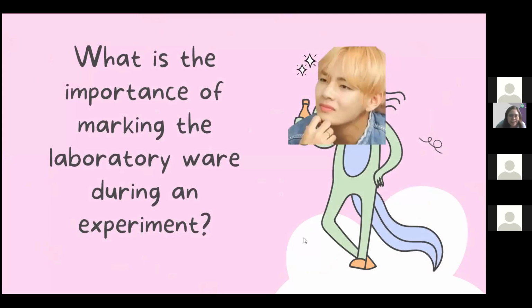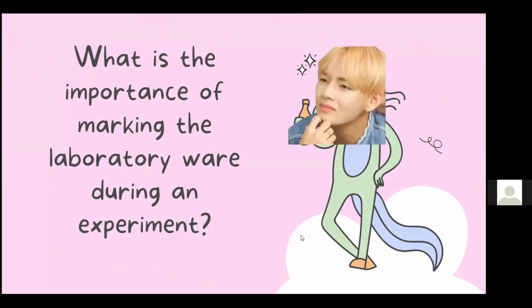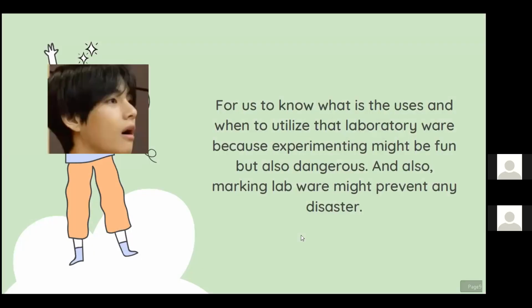Si Taeyong, yeah. What is the importance of marking the laboratory ware during an experiment? So simply, to avoid mix-ups. Next. Okay. Marking our glasswares will avoid mix-ups and that will avoid errors in the laboratory.